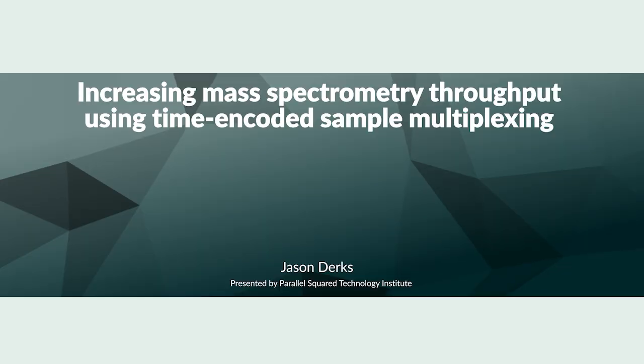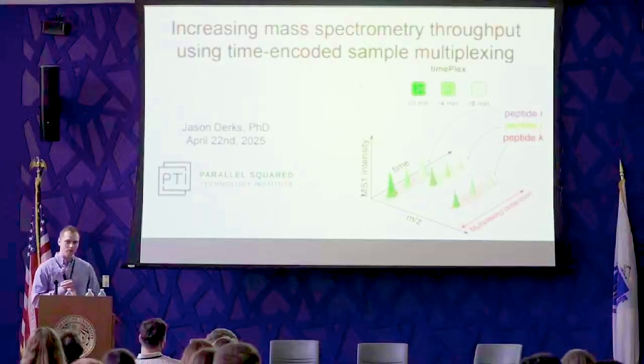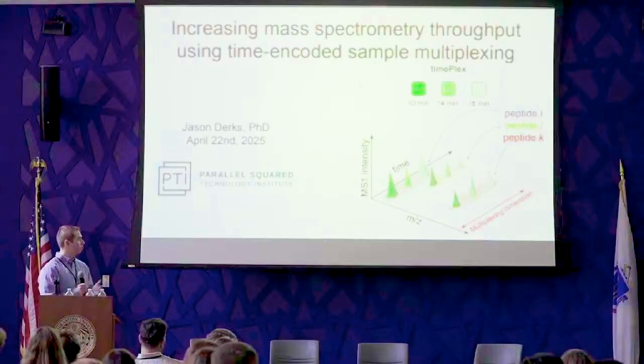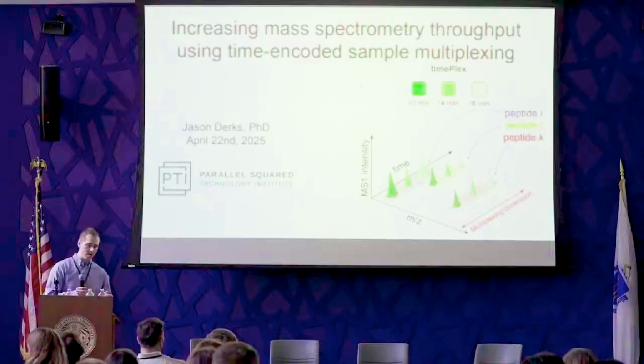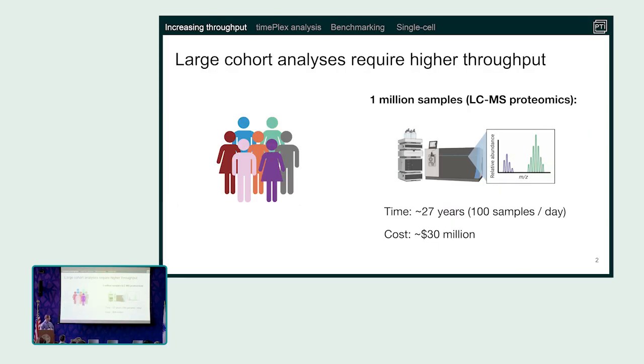We heard at the talks preceding this about multiplexing for ion analysis. What I will discuss now is multiplexing in an orthogonal domain. Great, yeah. So very excited to introduce this for the first time publicly. I think this is a really interesting technology that we've been developing to scale throughput for analysis.